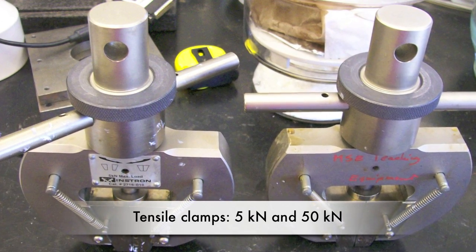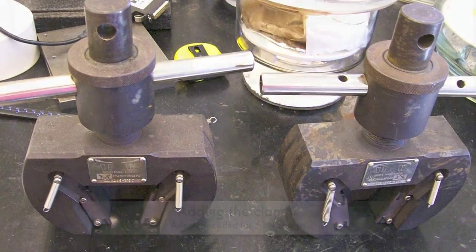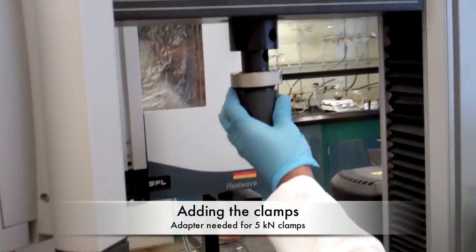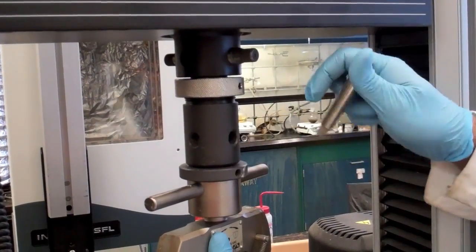For tensile tests, 5 kN clamps or 50 kN clamps are used, depending on the load that will be imparted on the sample. To install the 5 kN clamps, an adapter must be added using a pin. Then the top clamp can be added in a similar manner.